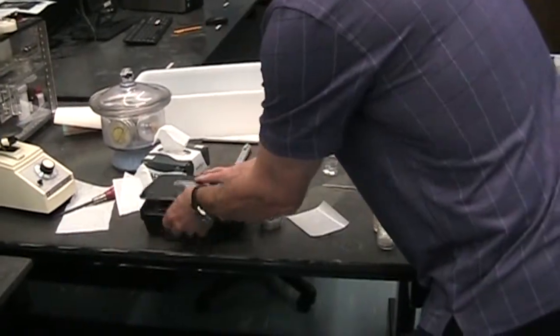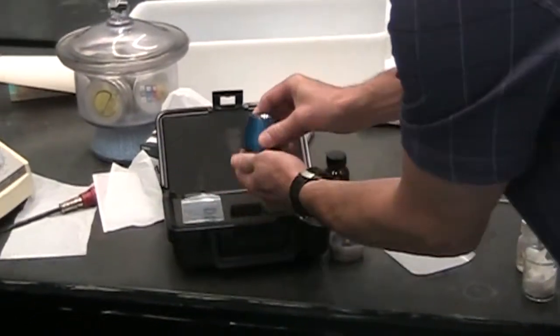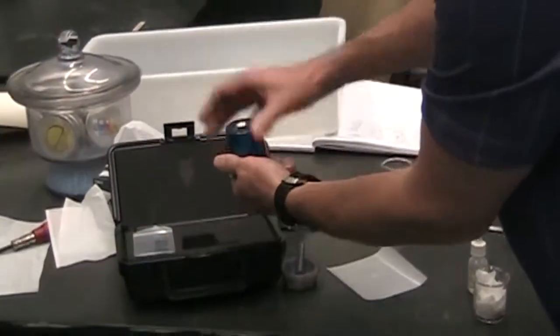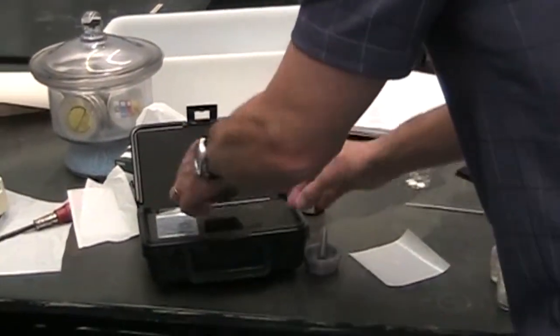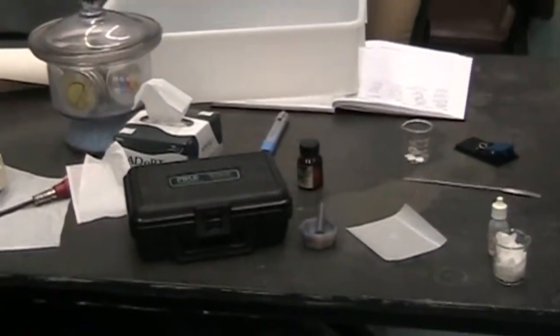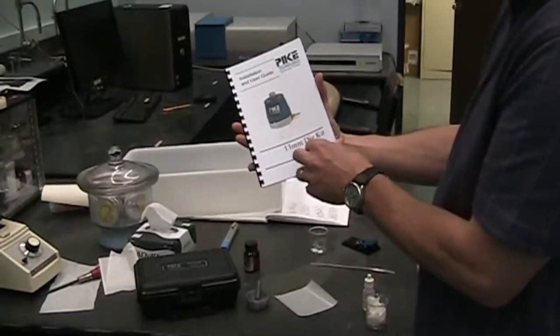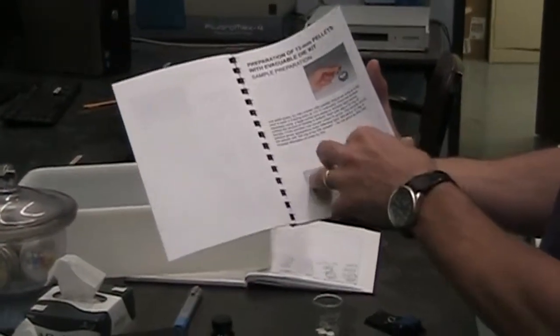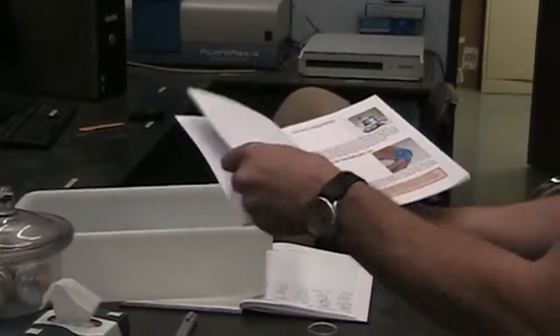So the kit for this is in here. This is basically what we're going to use to make the KBr pellet. I won't go into detail on that, but I will call your attention to the direction manual for the die kit. And it'll actually give you a lot of good pointers on preparing your sample, placing it inside the die.